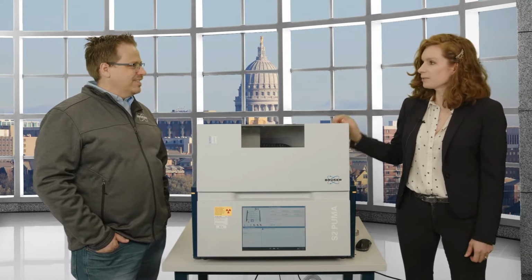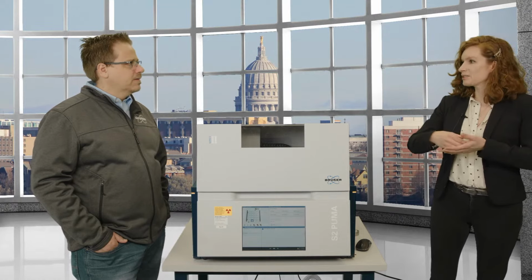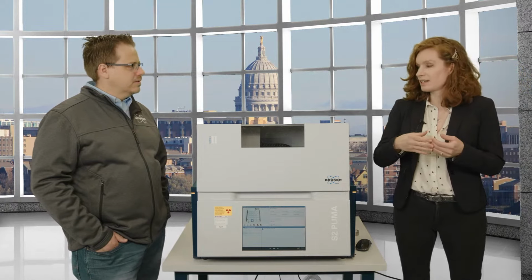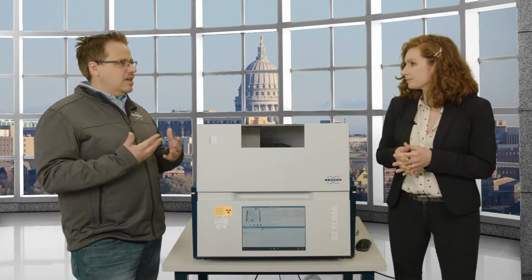The difference between WD and EDXRF is the resolution. In EDXRF, you only have the detector. As good as your detector is, that's as good as your resolution is. Whereas in WD, if you have a certain type of component, you can increase your resolution. Sure, there are limits, but as long as R&D keeps researching and figuring out maybe better crystals, there is still room for improvement. And that's that key differential.